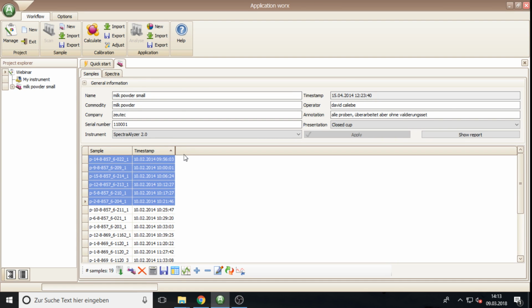Okay, let's go back to the toolbar. I stopped here in the position speaking about the option to predict data, which will be done later.